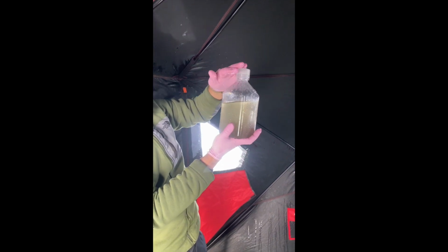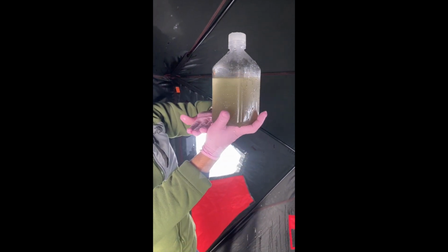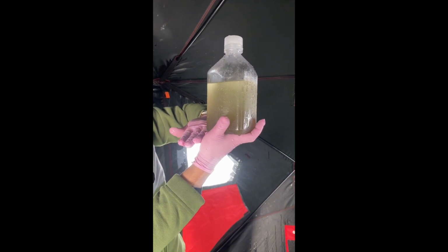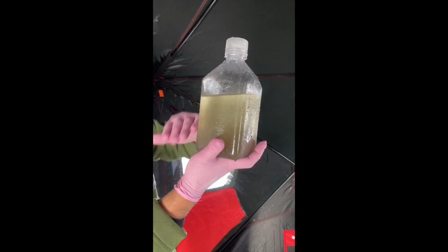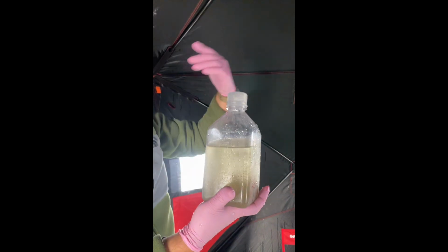And again, what we're going to do is let this sit upright and let all the inorganic material and detritus and hopefully some of the phytoplankton sediment to the bottom, and then in the lab we're going to carefully decant the zooplankton, trying to get a clean zooplankton sample. So we're going to do it once more for our second replicate, and that's pretty much it. What we're going to do is quickly write the tow depths, which again was 0 to 8 meters here, and the number of combined tows for each of these. Again, we're not being quantitative necessarily, we just want to get a lot of zooplankton here. And for us here, we probably could have gotten away with just 2 tows.